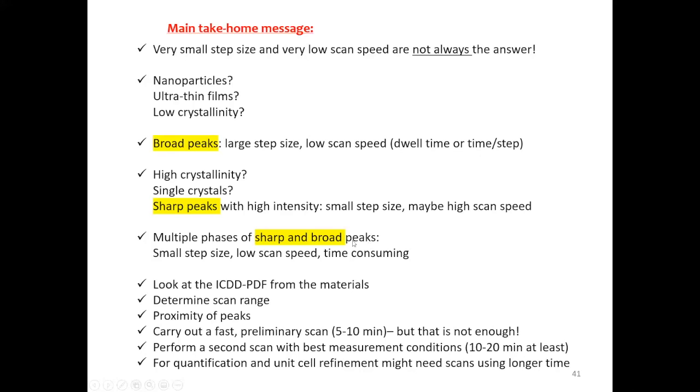So we got the question about Bragg's law, the instrument configuration, good manners, good practice for data collection. How about sample issues? What can you be doing wrong? How can your sample be affecting the quality of the measurement?